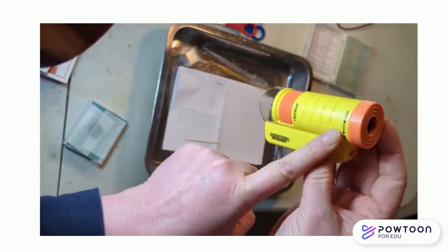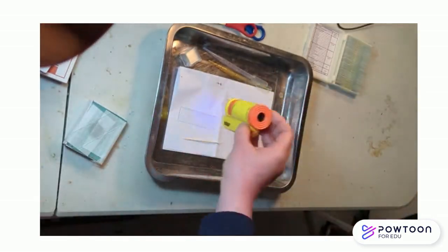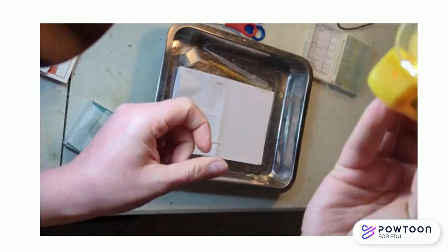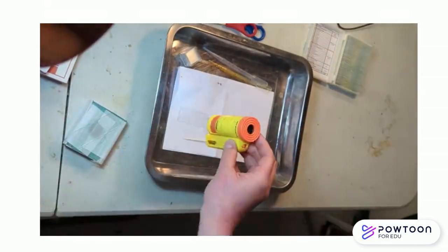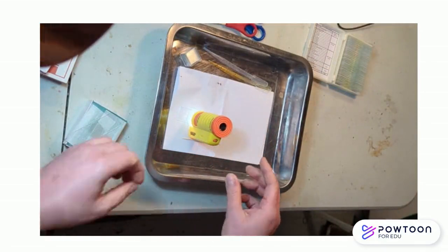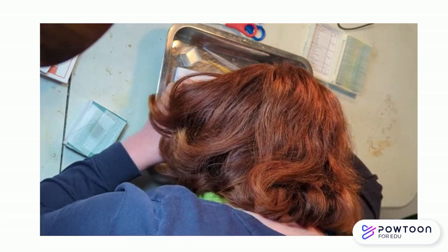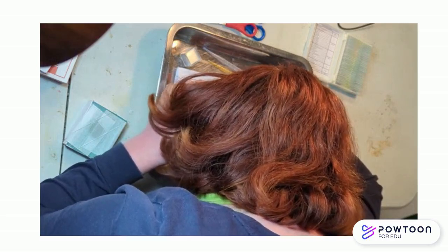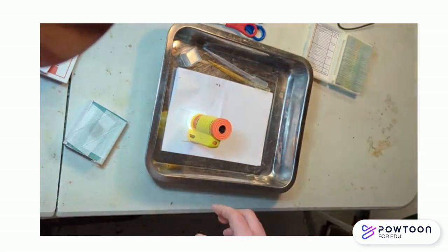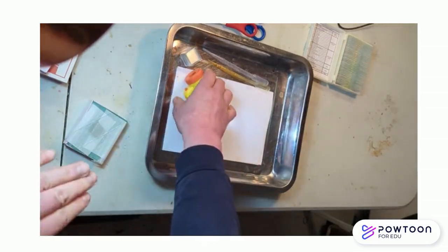Each of your juniors and seniors, although the juniors need a lot of help, will have to literally bend down. So switch on the light. I don't know if you can see it, but the light is on. Bend down over the slide, and then really try and work on the focus and on the magnification.